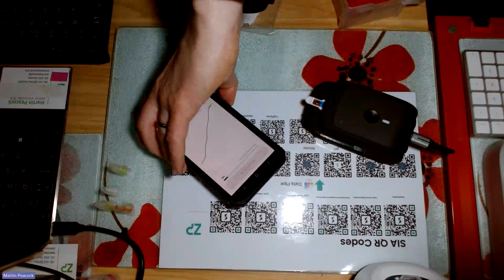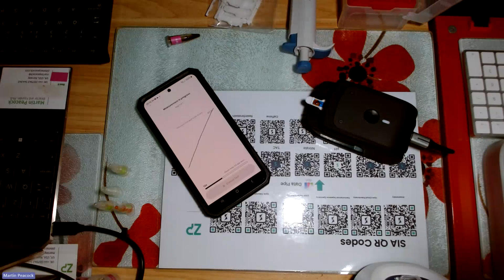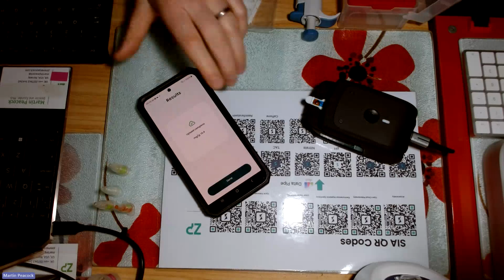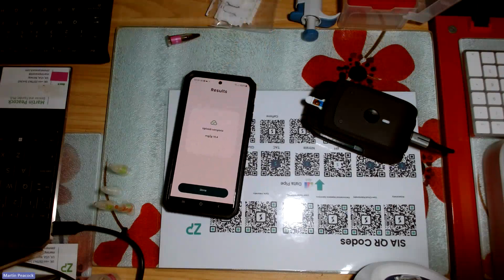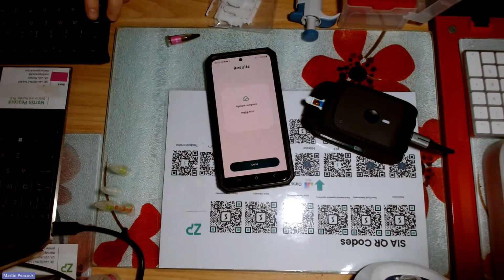Now, what this is actually doing is square wave voltammetry. But if you really want to translate research out of the laboratory and into the real world, people don't necessarily want to understand that this may be square wave voltammetry, etc. They just want the results really. So what this allows them to do, and that's giving me my result.